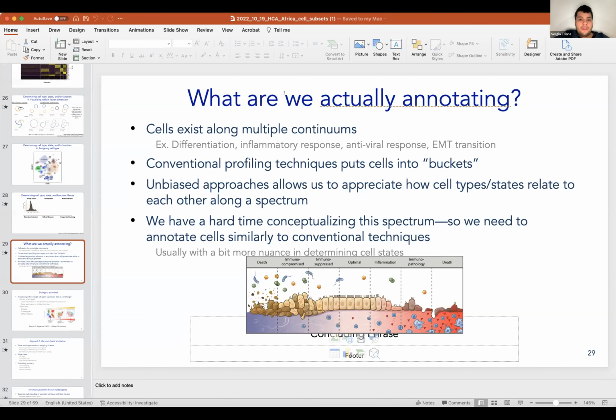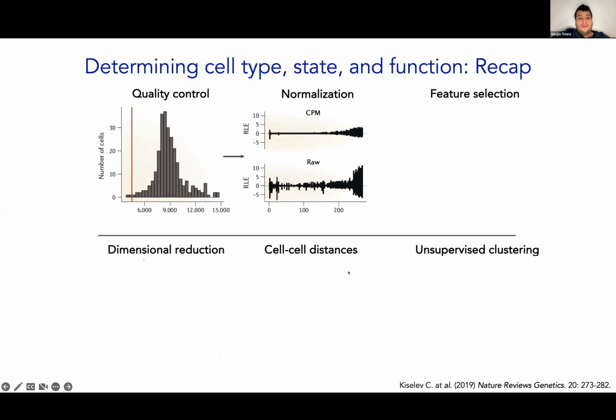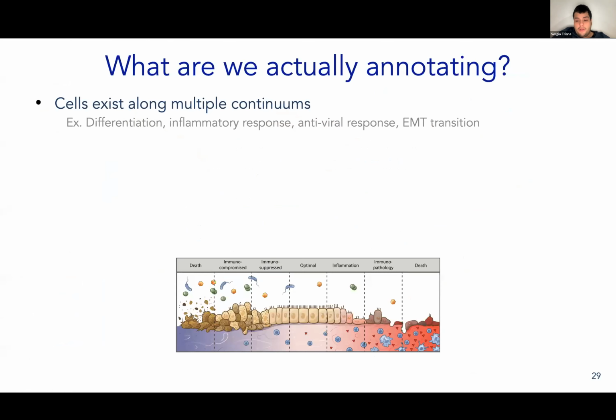I'll continue the presentation and I will be focusing on the cell type annotation. So feel free to interrupt me if you have any questions or write in the chat.